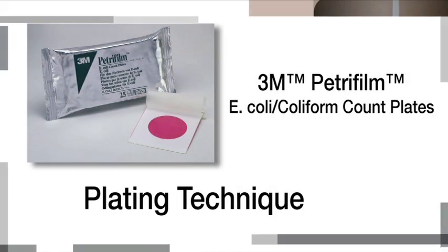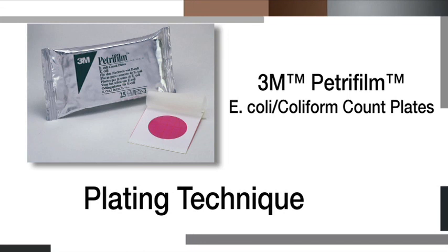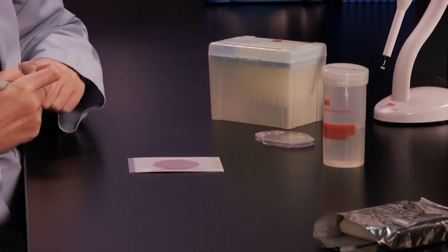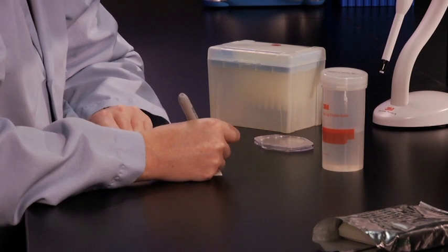Here's the plating procedure for 3M PetriFilm E. coli coliform count plates that feature a foam dam to contain the inoculum. Label the plate and place it on a flat surface.